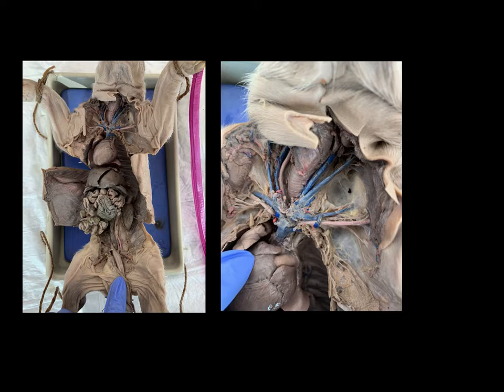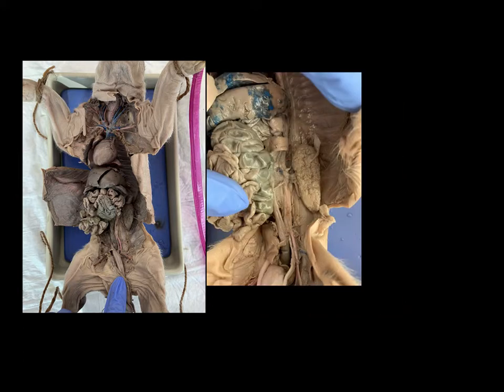So let's go to our next view. And again, to kind of orient you, now we're looking at this region right here blown up. It's kind of difficult to see because the veins down here did not take the stain very well, and there are some membranes that are not dissected away in this image.